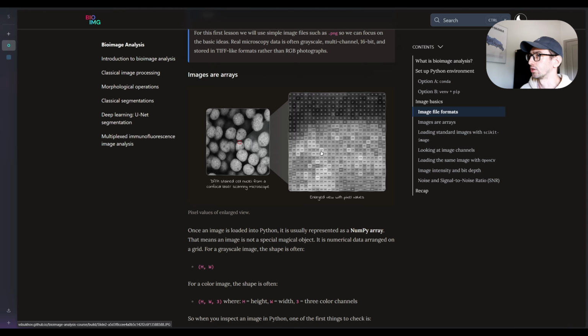So for example, you can say, I want to, I don't know, find the mean value of the image. Since it's a numerical array, there are h multiplied by w values because we have height and width. We can identify the mean value, and then say, if the value is higher than mean, it's true, and if it's lower, then it's false.